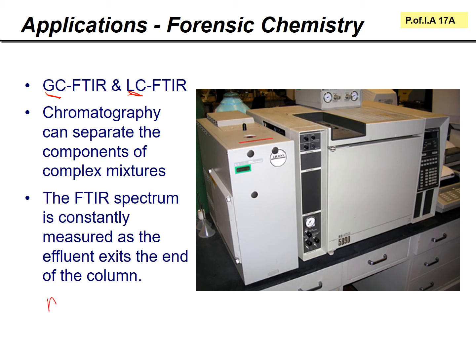Of course, mass spec is another excellent method to combine with GC or LC for identification.